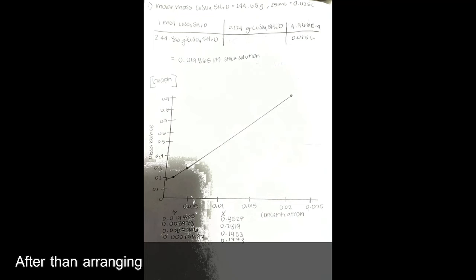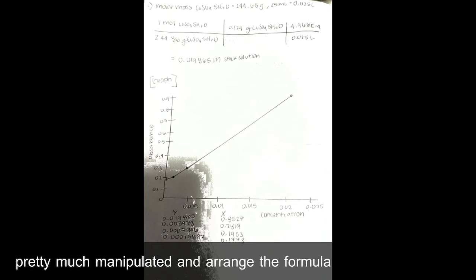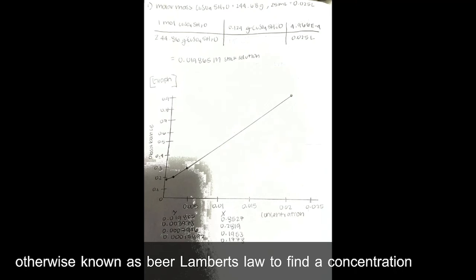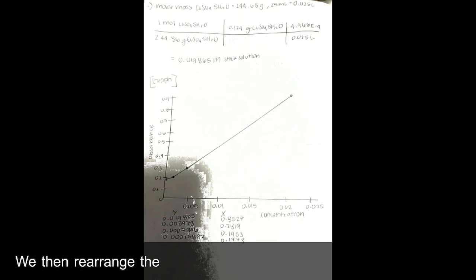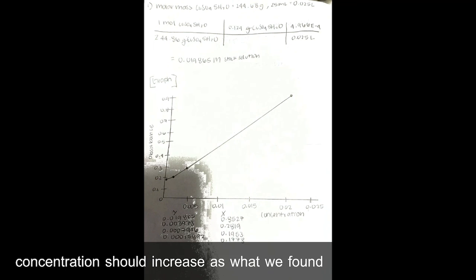After arranging those numbers and getting what we need, we rearranged the formula A = ELC, otherwise known as the Beer-Lambert law, to find the concentration, and plugged our found values into the formula, which gave us our variables. If absorbance increases, concentration should increase, is what we found, proven in the chart.